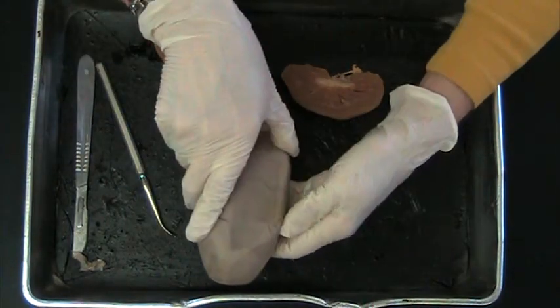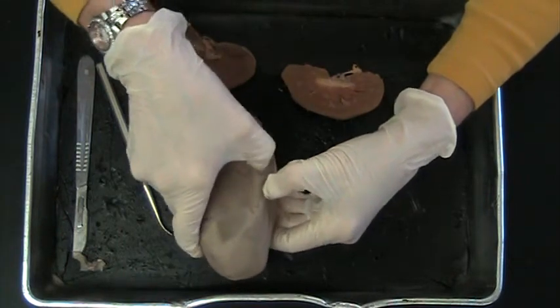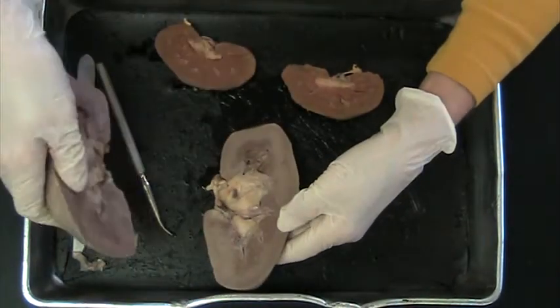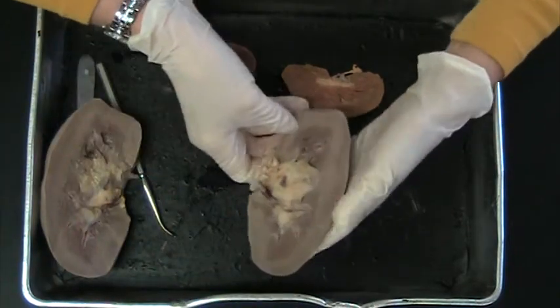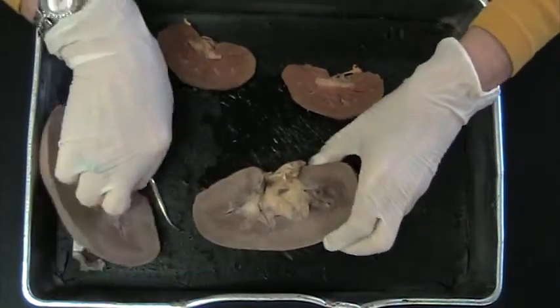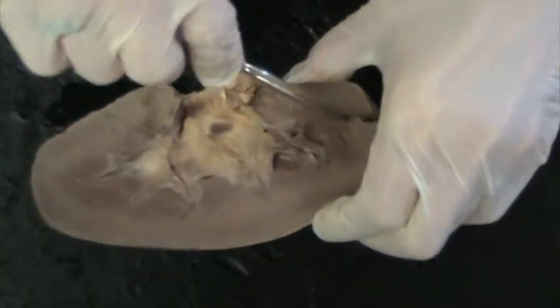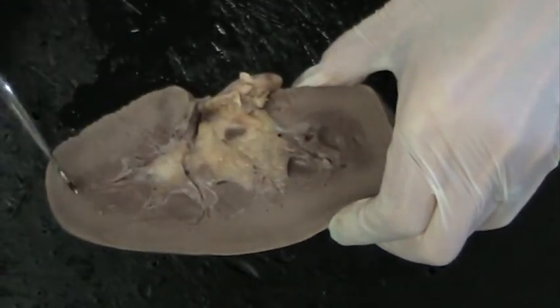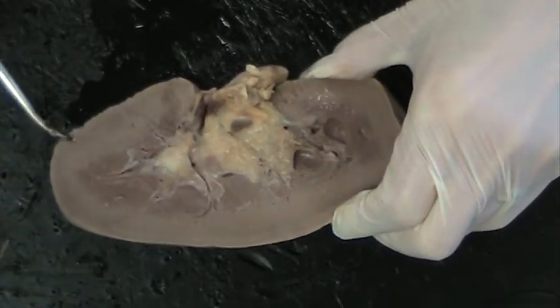Okay, and of course I've just already cut this kidney in half, dissected I should say. If we look at the inside of the kidney, the first part I'd like you to notice is this outer border called the cortex. And cortex, again, is anatomical for an outer border.